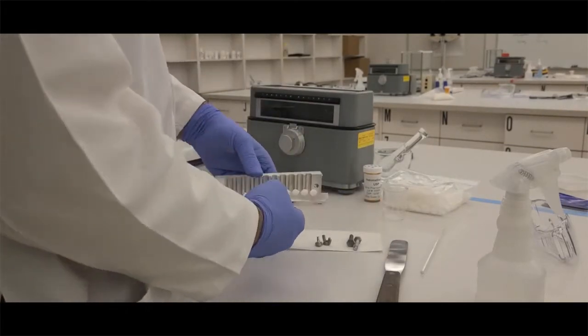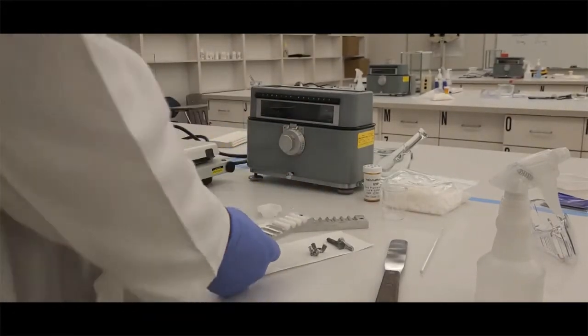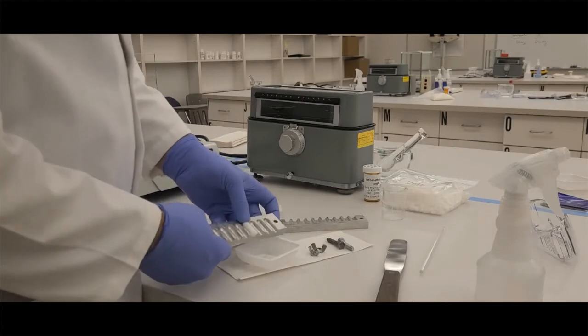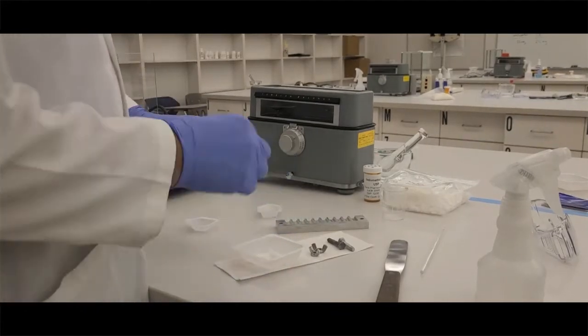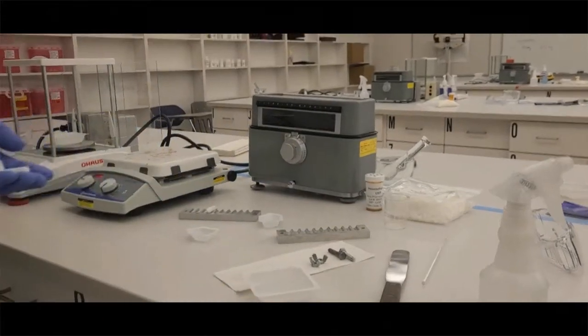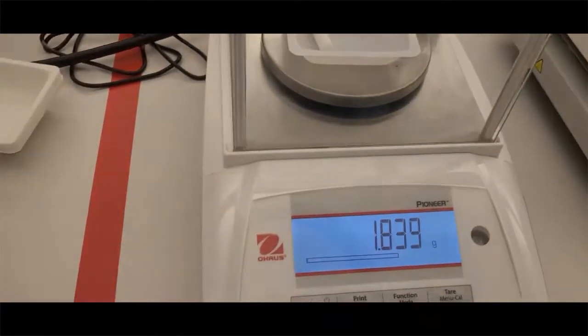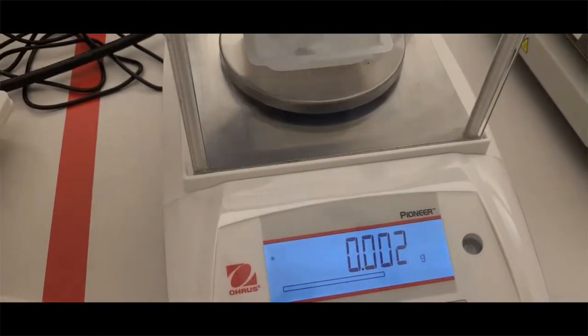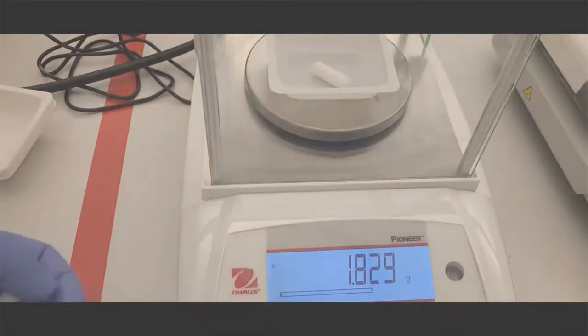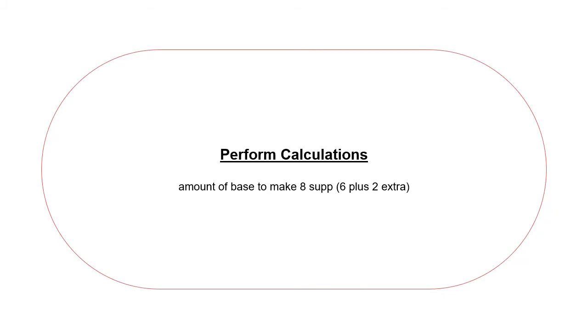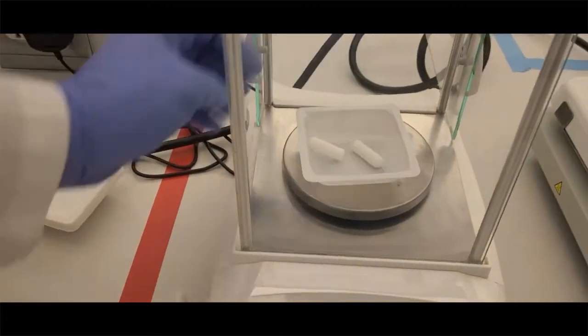This was time-lapsed here. Now that they're cool, I'm going to pop those out of the suppository mold. Again, I only need to pop out the three—that fourth one is just the extra one that I had excess in. I'm going to take those suppositories, the three full ones, and weigh them. I'm going to get the average weight of one blank suppository.